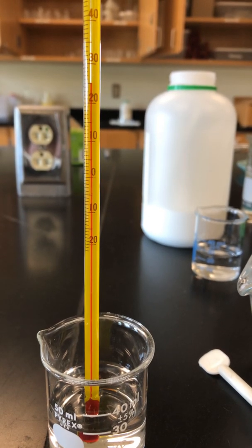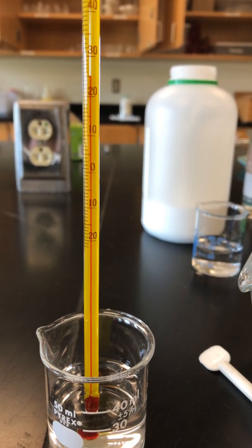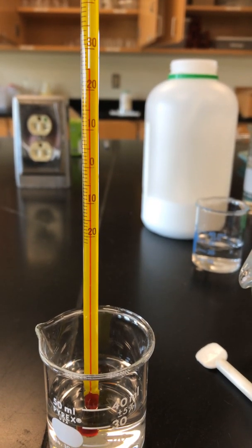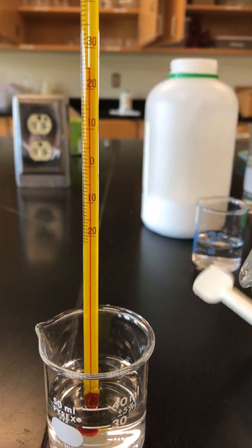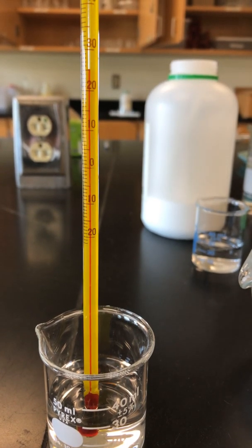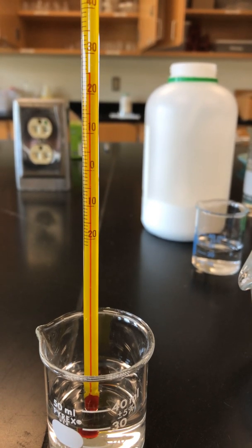So we're looking at our Endothermic lab. Right now I have approximately 30 milliliters of water in our first beaker, and I need you to take a look and record the temperature of the sample.